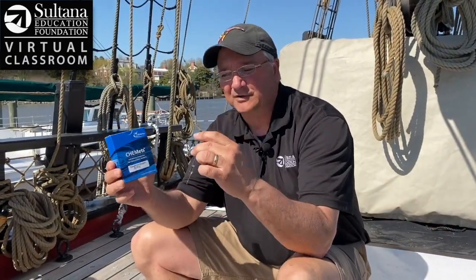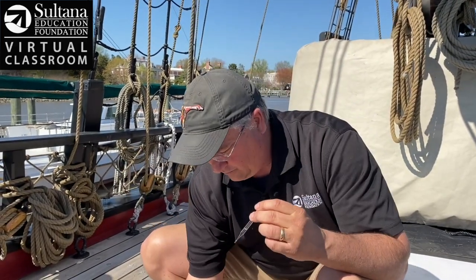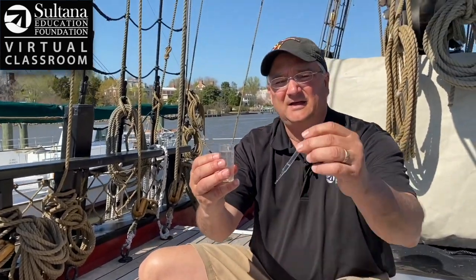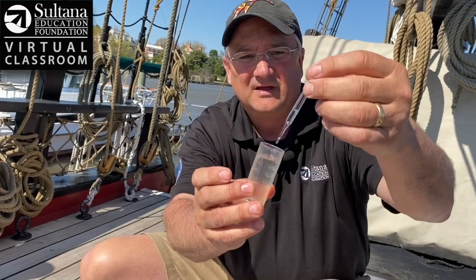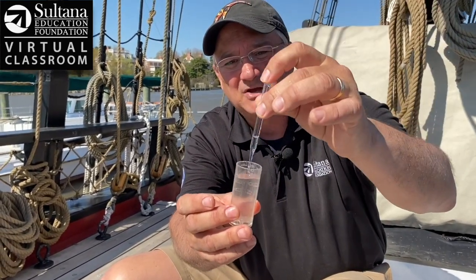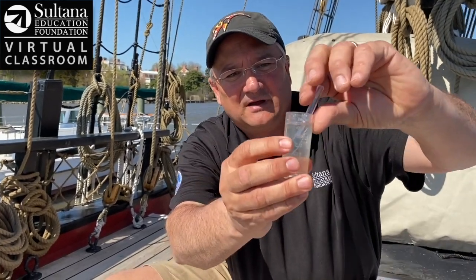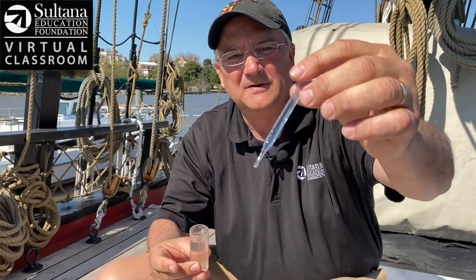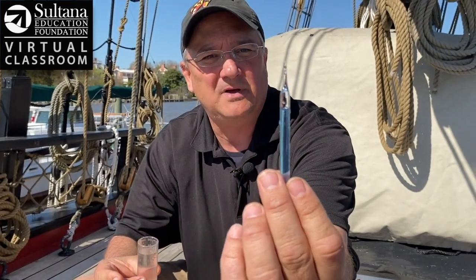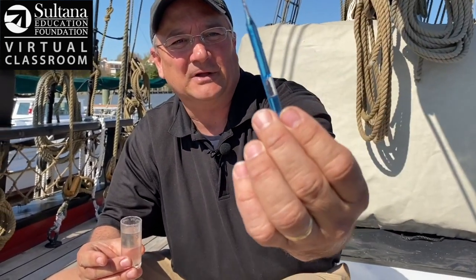To conduct this test, I have a really cool unit from Chemetrics here — this is called a self-filling ampule. What I'm going to do is take a water sample and fill it up to the 25 milliliter line. I take this self-filling ampule and put it right in the bottom, and push it so that the tip breaks off. You can see there's a reagent in there. That reagent is going to react with my water sample and turn this solution into a different shade of blue. So I'm going to break the tip — there it goes. The water is now in there and there's a bubble that I'm going to have go up and down to thoroughly mix the water in my sample with the reagent in the self-filling ampule.